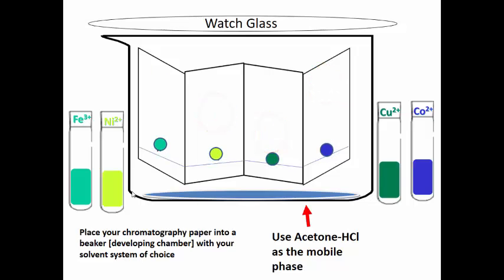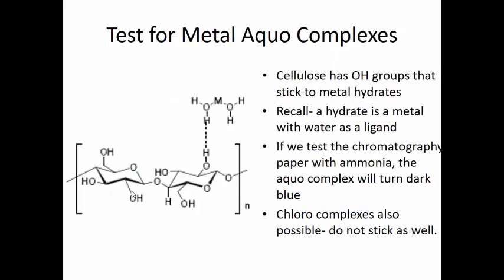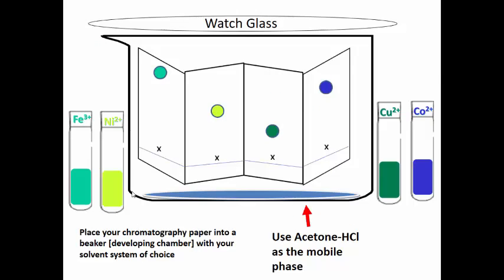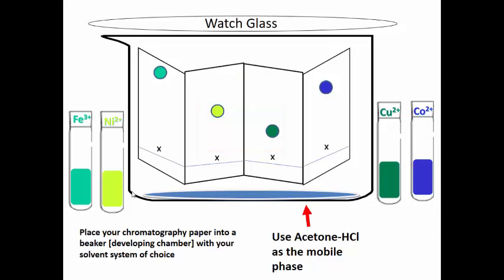Let's look at those again. The iron is flying up the chromatography paper, so is the cobalt, but the copper and nickel are moving a lot slower. The ones that move really slowly are really sticking to the chromatography paper. The ones that move quickly are not sticking very well.